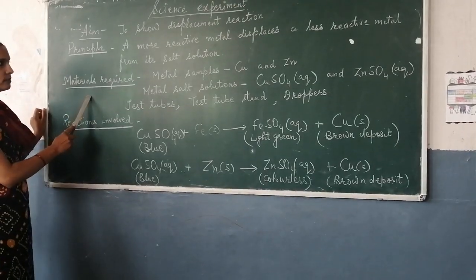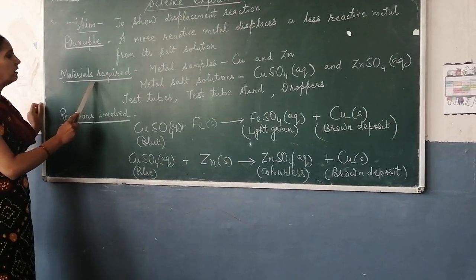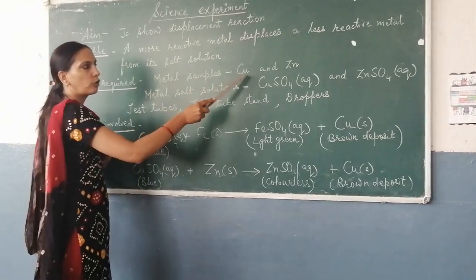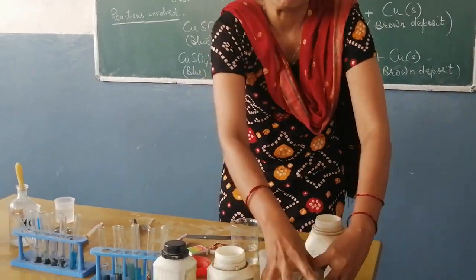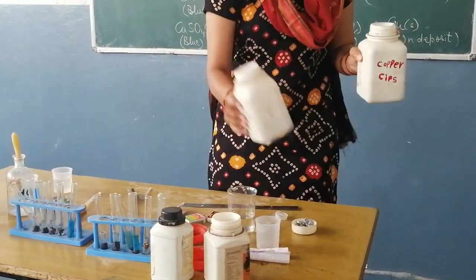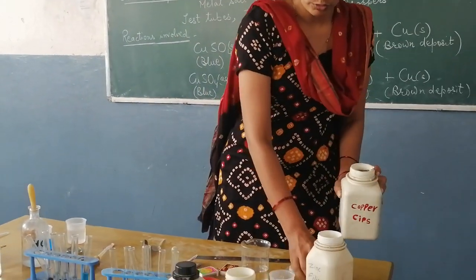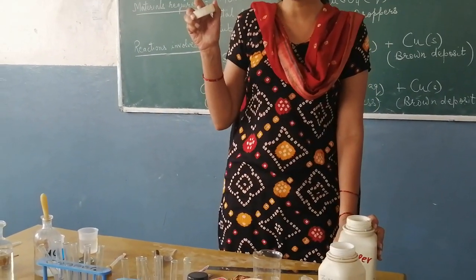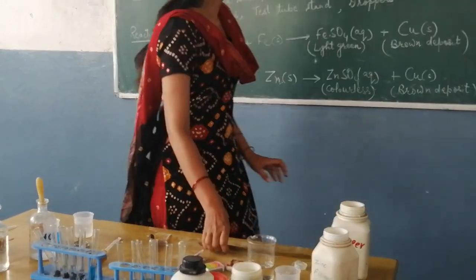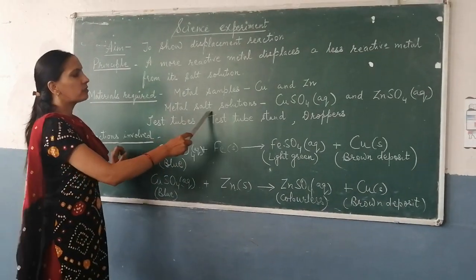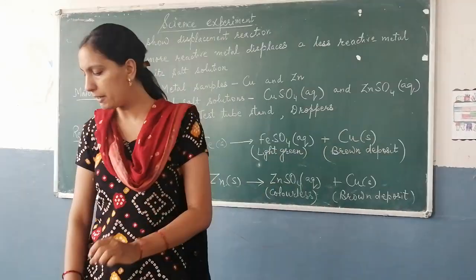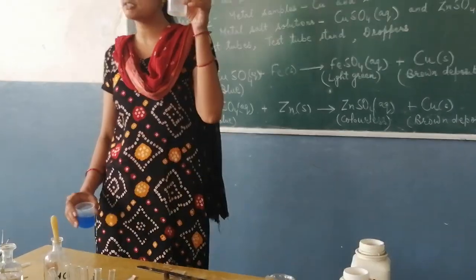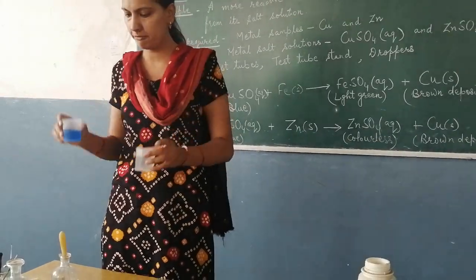What we require for this practical: metal samples copper and zinc. This is copper, and this is zinc. I have shown you the zinc here. Next, metal salt solutions: copper sulfate and zinc sulfate. I have prepared two solutions. This is zinc sulfate and this is copper sulfate.